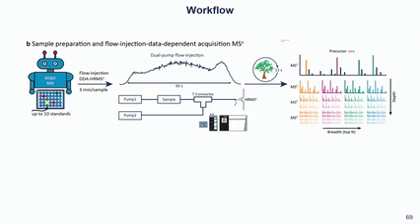If you want to work with your compounds, of course, you can use your LC-MS setup, and then you can also do the library building, so it's not set only for this multi-stage flow injection method, that's just what we used as the workflow. So you see we needed about 13 seconds per molecule, which is like the MS3 at maximum, and that's why we went for the flow injection method instead of having the separation with an LC-MS setup.